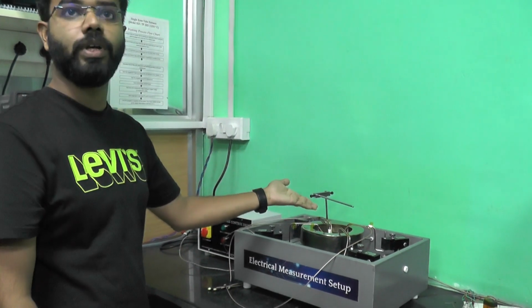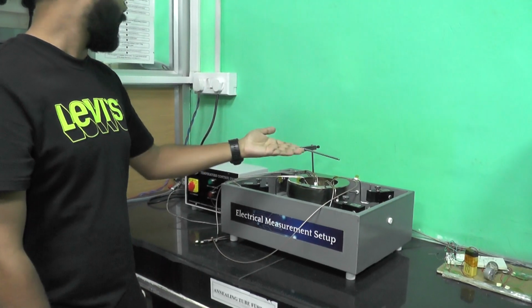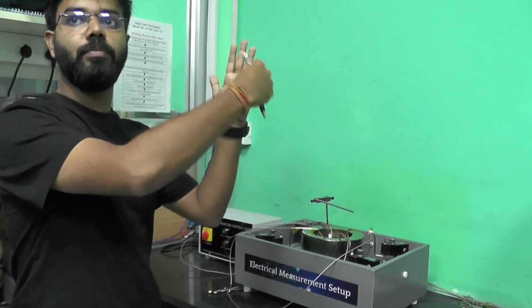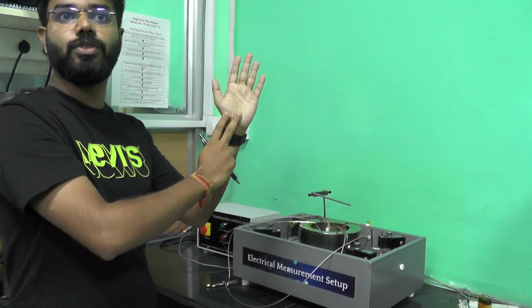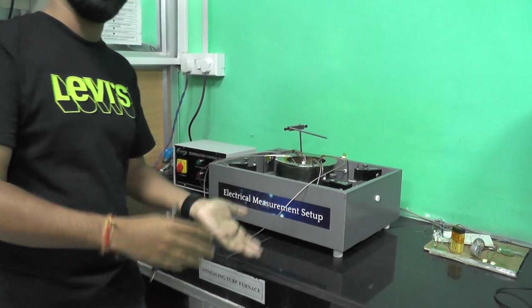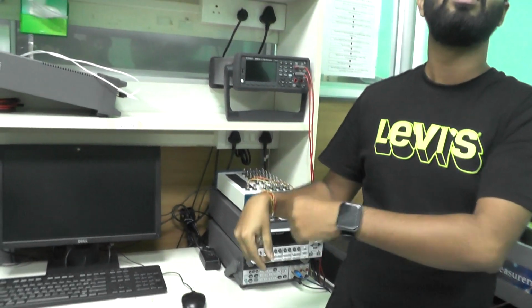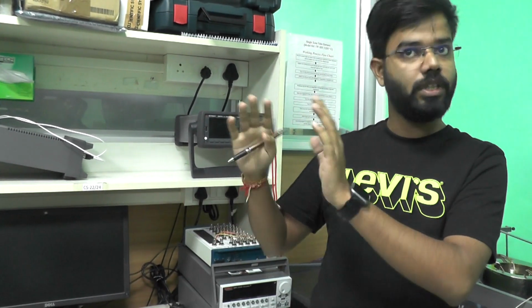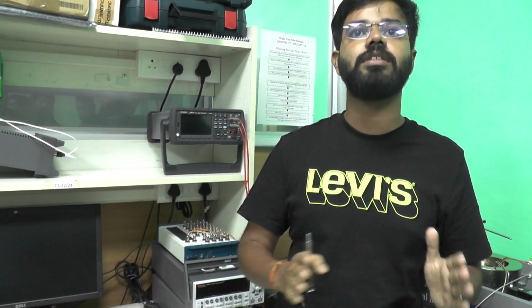So exactly what we are doing here, using our switching network, this switching network just switches each and every time. So it sources there, measures there, again it switches, it sources there, it measures there, again it's doing. After getting all of the measurements, we integrate them inside our LabVIEW system, we get all the data, we average it, and after that we have our own script there using the Van der Pauw method, and finally we get the sheet resistance that we desired.